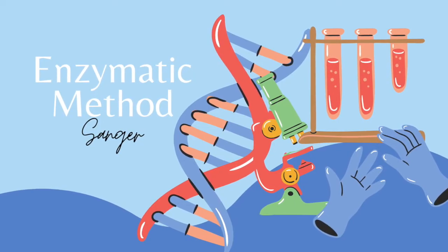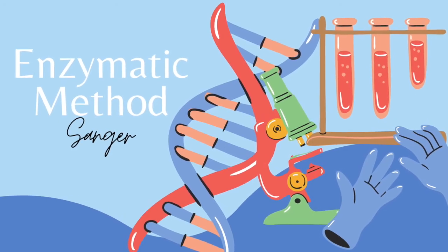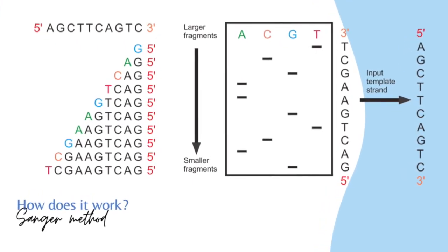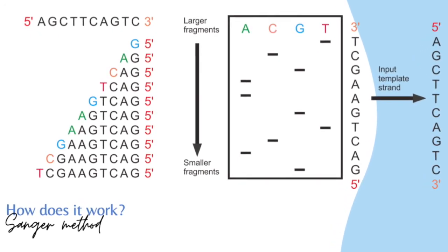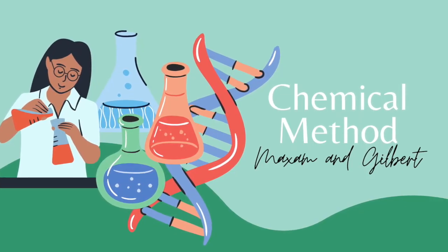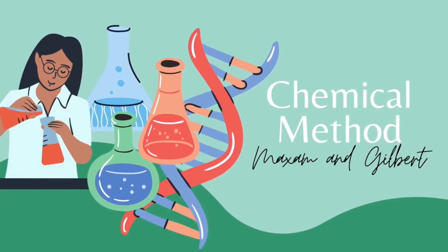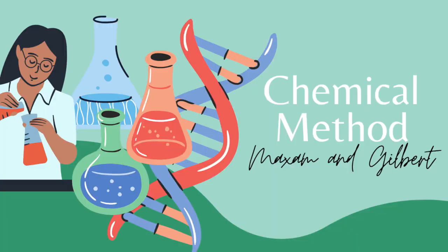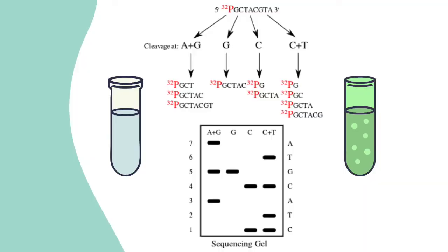Today, the most widely used method for nucleic acid sequencing is the Sanger method. However, it is fair to say that the method of Maxam and Gilbert is the most suitable for determining the sequence in short DNA fragments, because here you can determine the sequence from the first base. In contrast, the Sanger method only allows reading starting from the 10th to 20th base.